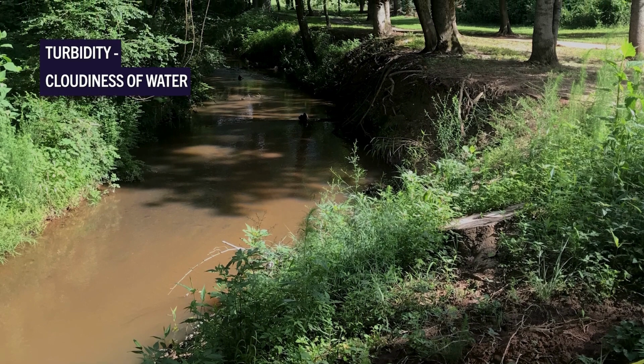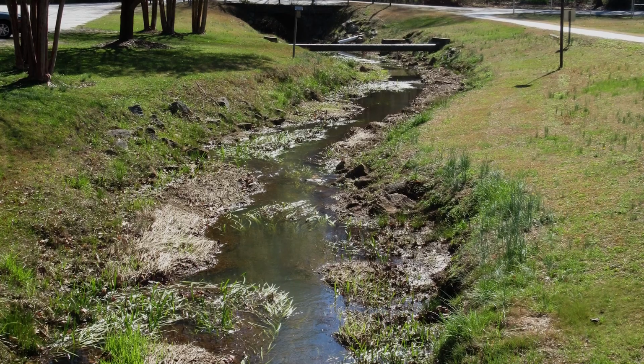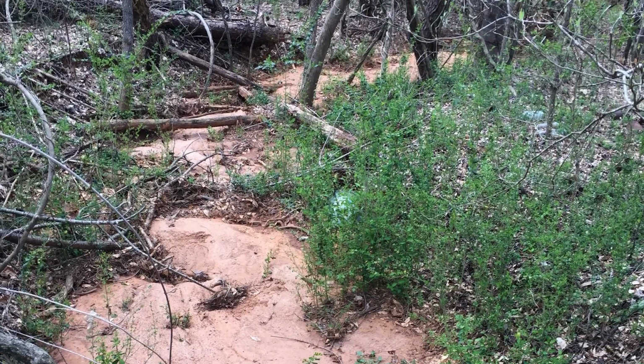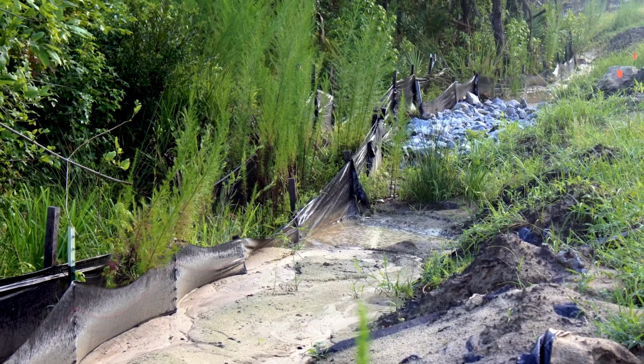Measuring how suspended material in water affects light penetration into the water column. Turbidity can impact photosynthesis and water temperature and can be a signal to local resource managers of too much unmanaged runoff to a waterway. More on that later. Let's learn the steps of using a transparency tube. I'm Emily Anderson, here to show you how.